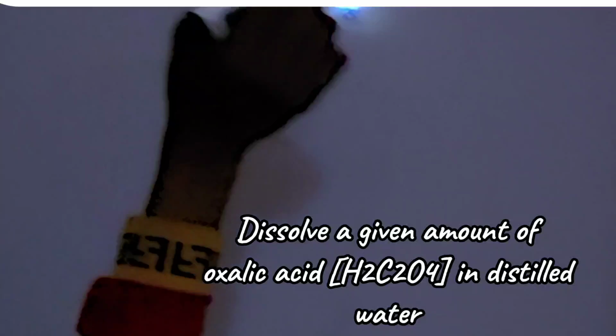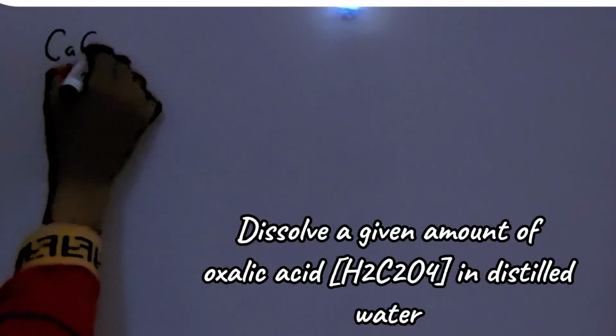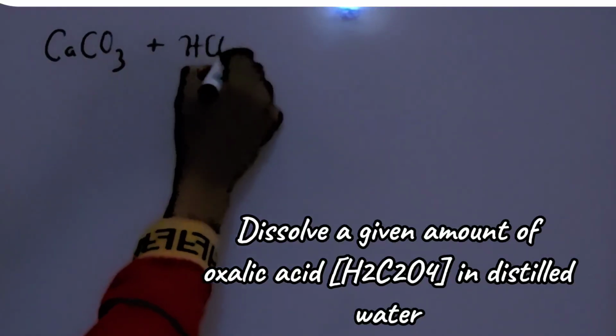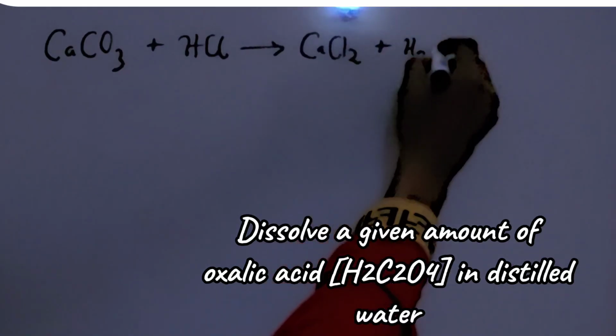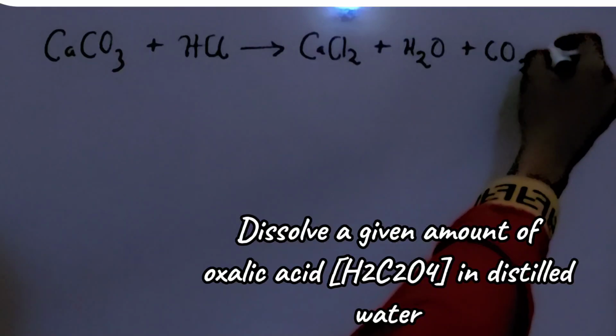Remember, we had the first reaction. This is going to be equation 1. Let's write it. Calcium carbonate reacting with HCl to give CaCl2 plus H2O plus CO2, which is evolved.